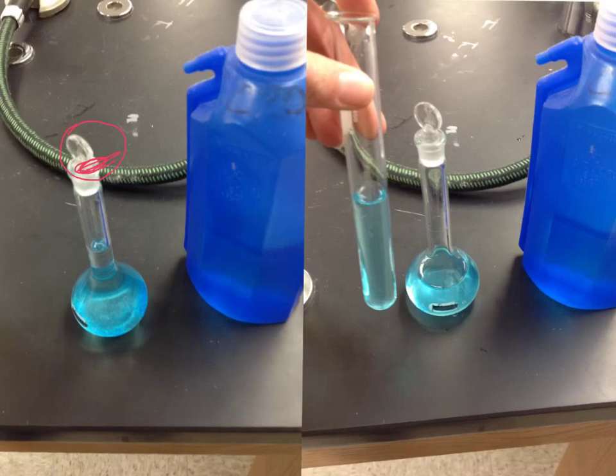Once you have it ready to go and it's all thoroughly mixed, you're going to put some of your solution in a test tube here, and then you bring that up to me, and the way it will get checked is basically just a color target. So your color of solution should match my color of solution of the same molarity.